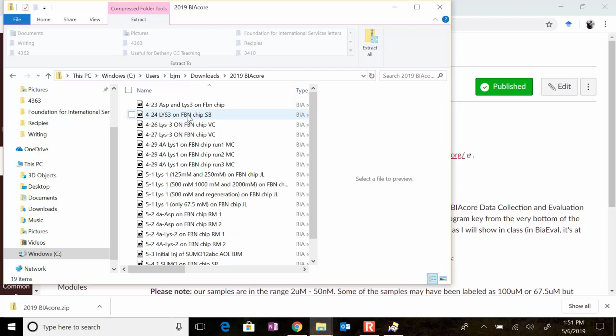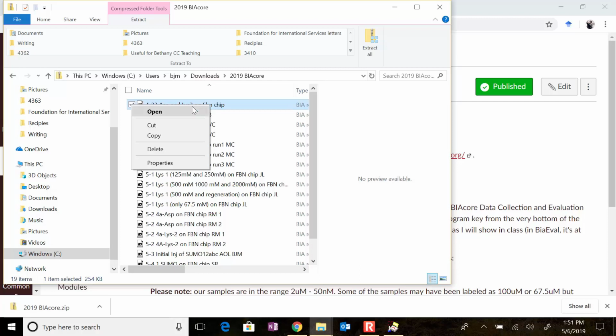I'm going to show you how to do this, but what I want you to do is take your data from the data that you collected by yourself. So you don't have to do this again.